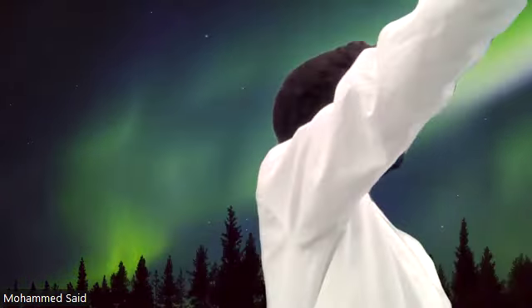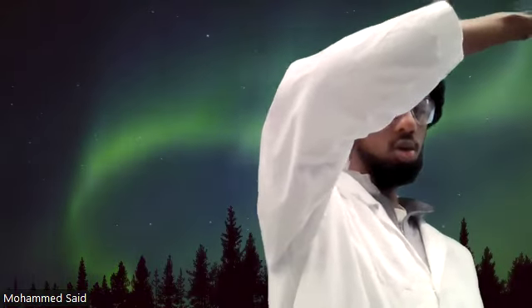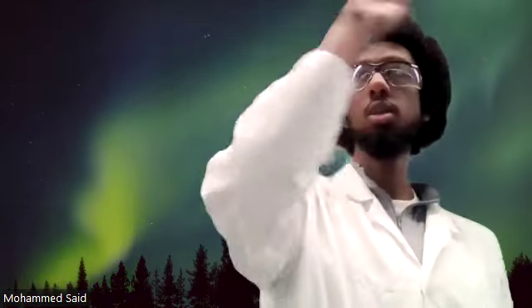Now, regarding a few other things, yes. So you'll be separated into groups as before. Group 1, pH 2, group 2, pH 4, group 3, pH 6, group 4, pH 8, group 5, pH 10. So just bear in mind that you keep note of these details and then incubate them. We'll try to place all the tubes back into one single blue rack, and then we'll place them into the 37 degrees. I'm going to go down and talk a bit about osmolarity.